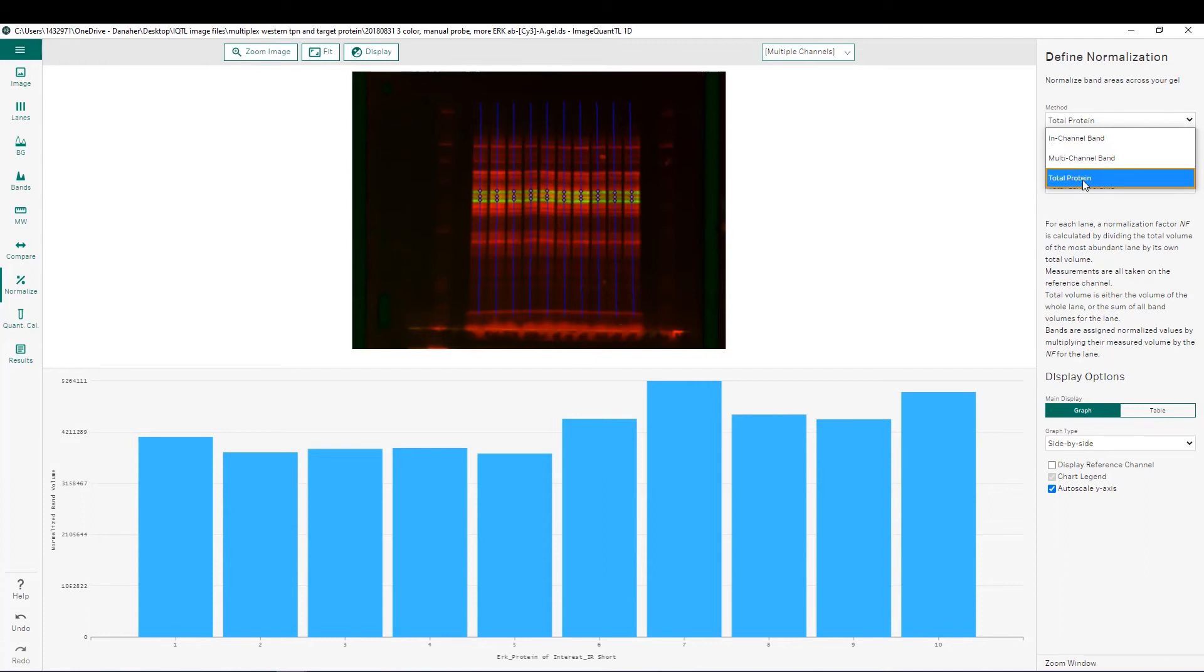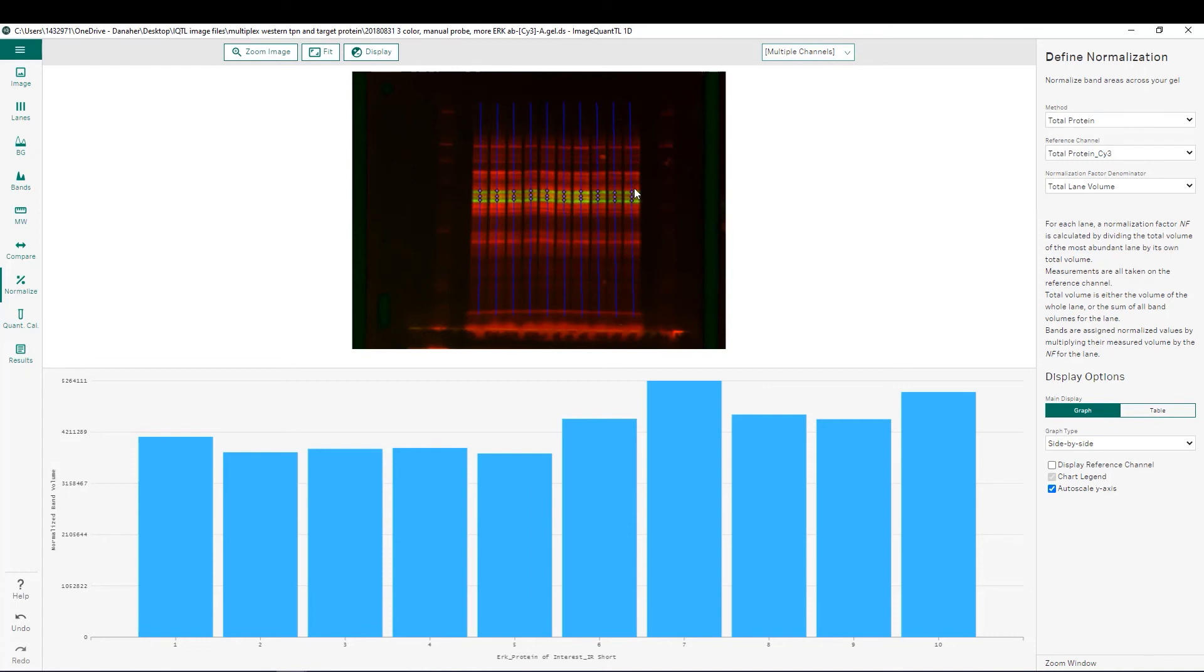Either in channel with a single band, multi-channel for a single band which are both utilized with a housekeeping protein, or finally you can choose total protein which we have shown here where we have one channel dedicated to total protein normalization in the red and then our protein of interest is displayed in the green channel.